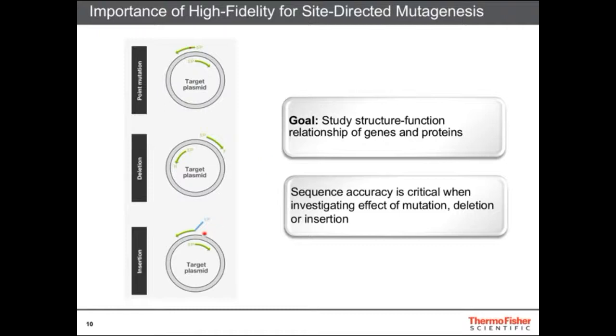And the last is maybe you want to actually insert additional sequences into your plasmid. So you will design your primers, and actually on the 5' end of one of your primers, you'll add additional sequence. And again, PCR, ligate, and clone, such that you are inserting that new sequence into the overall sequence of your plasmid.